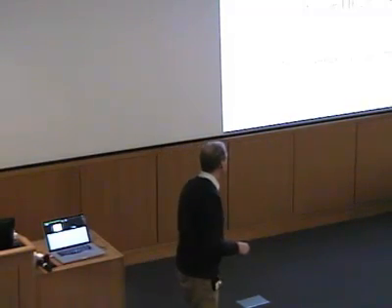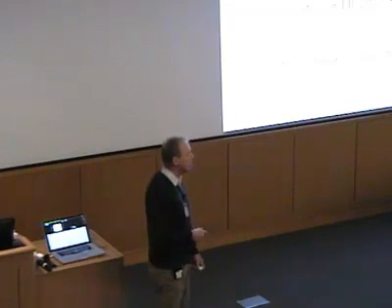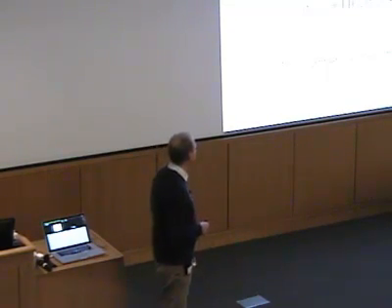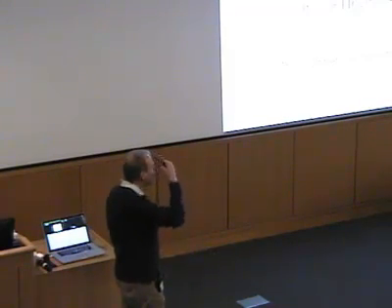And so this number can become really large very, very quickly, right? So even for small molecules, the number of lines in an EPR experiment, at least theoretically, is very, very large. What saves us in some cases is that the hyperfine coupling constants to many of the nuclei are very small and are not resolved in the spectrum. But in general, we can expect to see many lines in the spectrum.